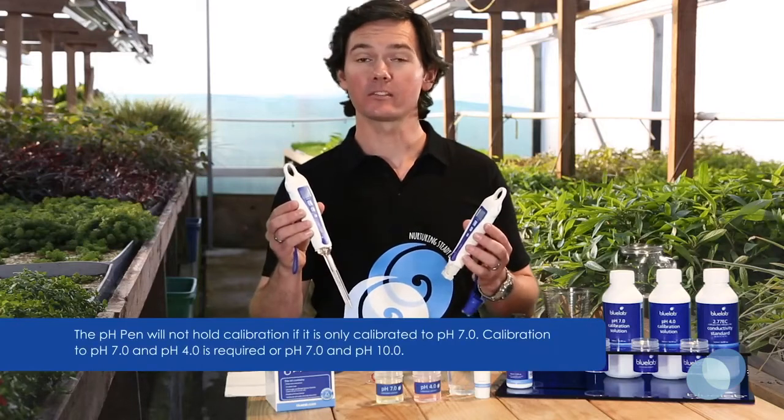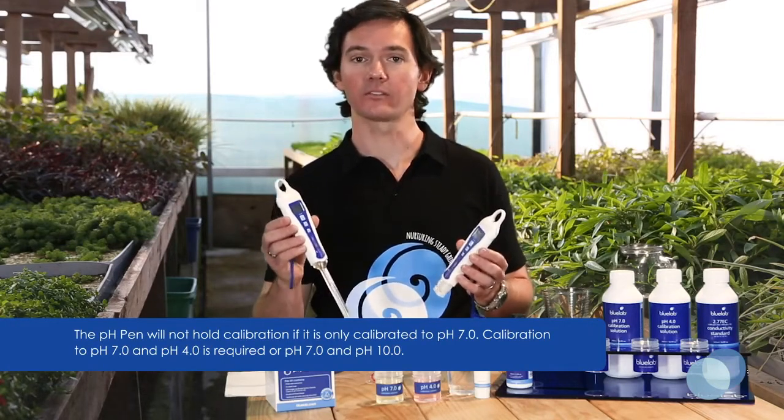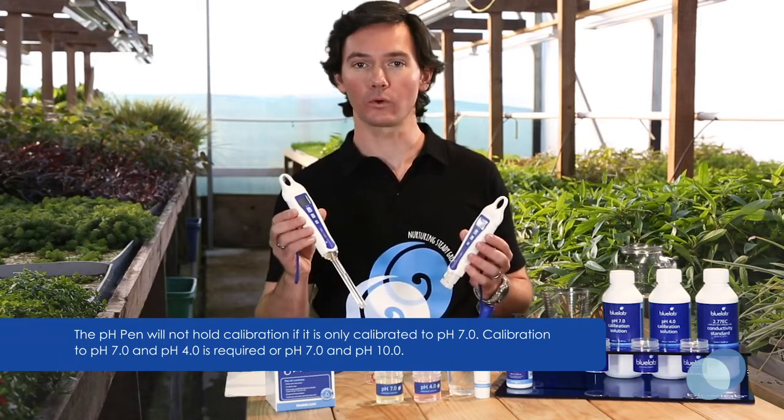To maintain a reliable pH reading between calibrations, the Bluelab pH pen should always be calibrated to two points. Also remember that you should always start calibration with pH 7 solution first, and then pH 4 or pH 10.